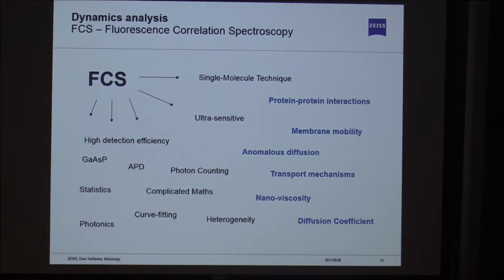FCS can go very far. As mentioned, protein-protein interactions, membrane mobility, nanoviscosity, diffusion coefficient, etc. This can be performed on any of our LSM 880s.